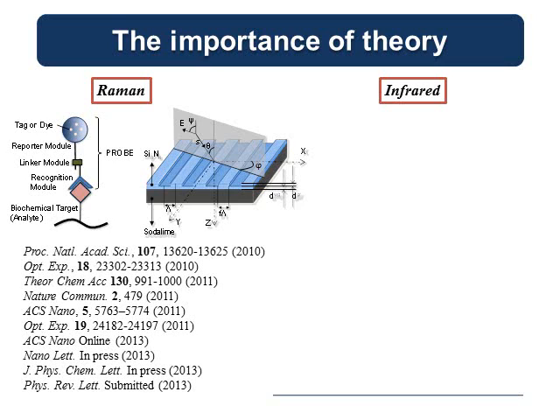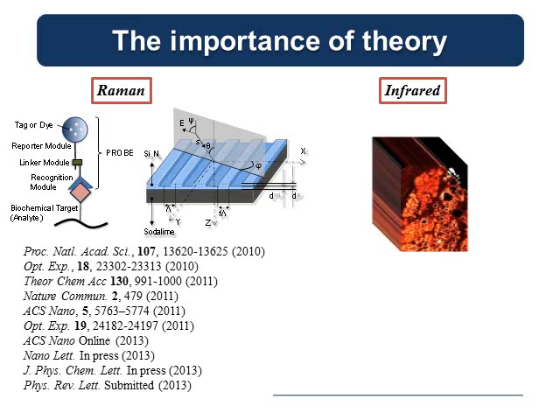And what I'll do is focus a little bit on the infrared imaging aspect. So as you've all heard perhaps in this meeting, we can now get pretty nice data sets that look like this. This is essentially an X and Y image, and then in the Z domain, there's a spectrum. So getting spectra out or getting images out now is fairly routine. In my opinion, the challenge is, how do we take this data set and turn it into knowledge? How do we take it and turn it into knowledge that's actionable, actually, which is perhaps a greater challenge.